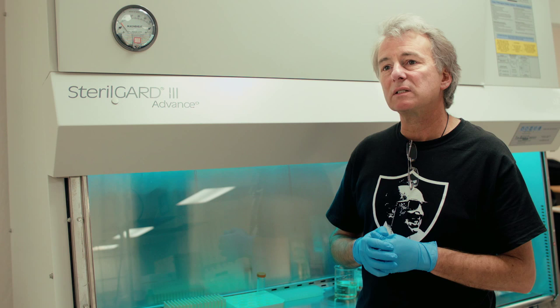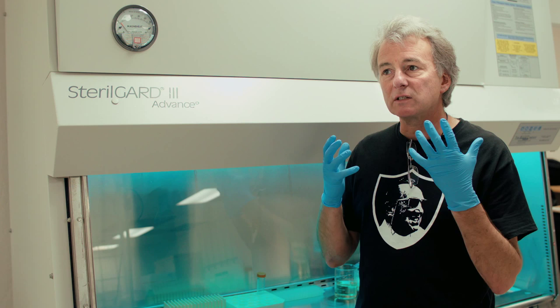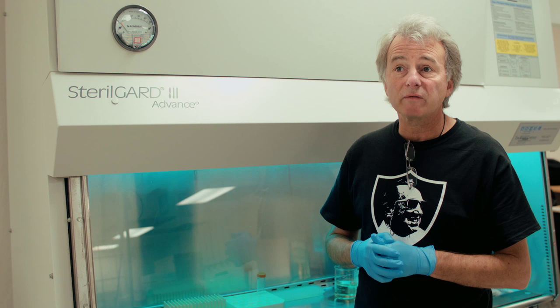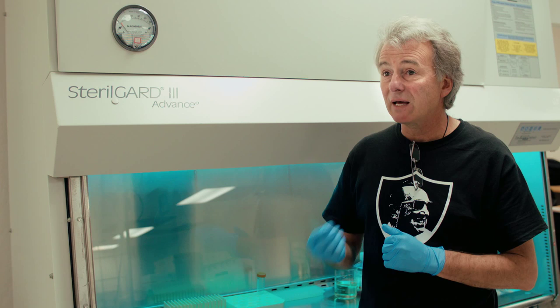And they spin it down in what's called an ultra centrifuge, because viruses are very small, they're very light, so it needs a great deal of g-force, like 100,000 times g, to pellet the virus. And then they send the pellet in a little bit of medium.